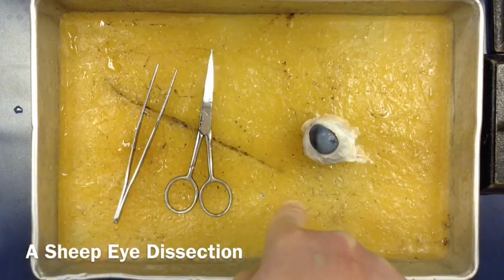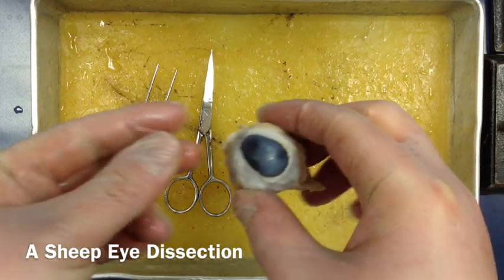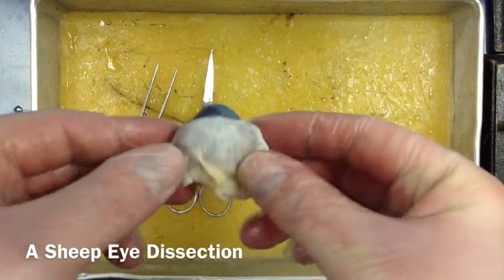This yellow part you see here is all wax. The wax is really useful when we're sticking pins inside our dissection tray so they stick into the tray. Here's our sheep's eye, and you can see that it's quite white with a lot of stuff around it.